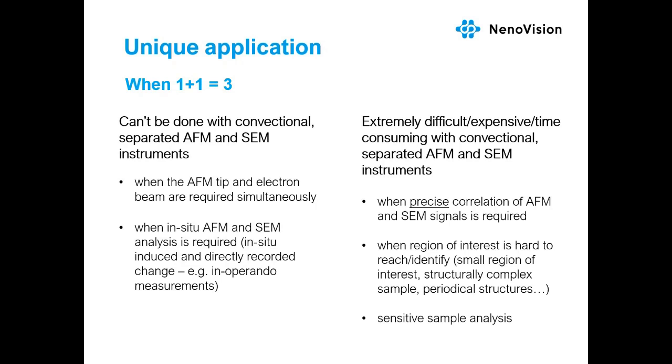And there is another case, when analysis on separated AFM and SEM instruments is extremely difficult, expensive, or time-consuming. So by the end of the day, you would not do that, or it's extremely complicated.